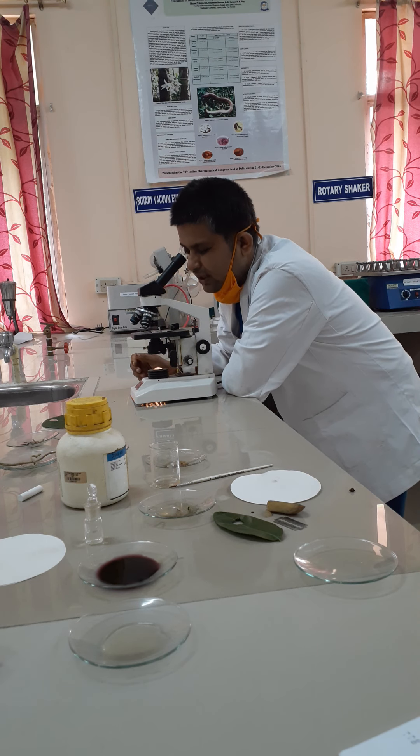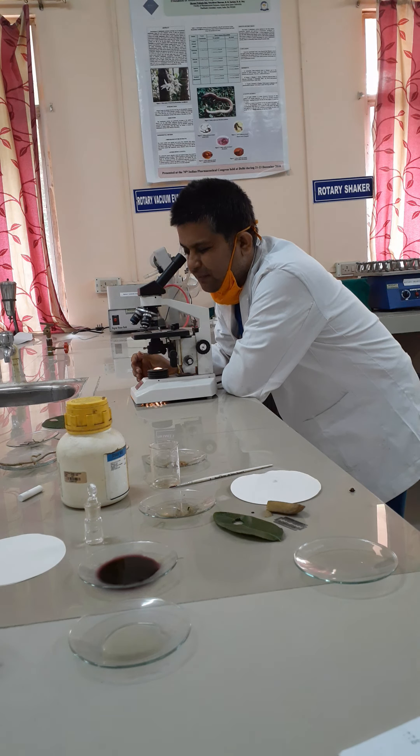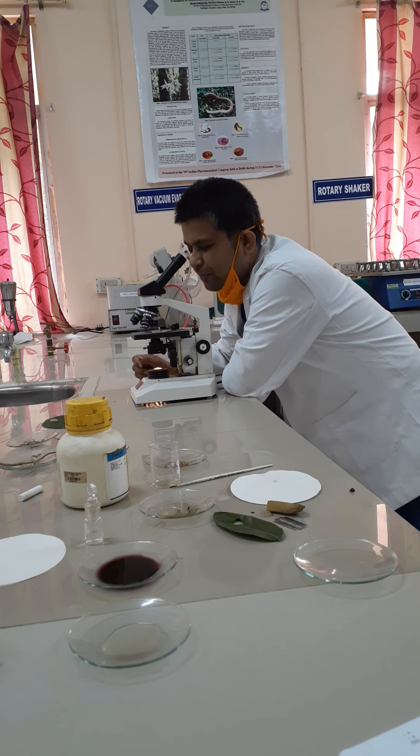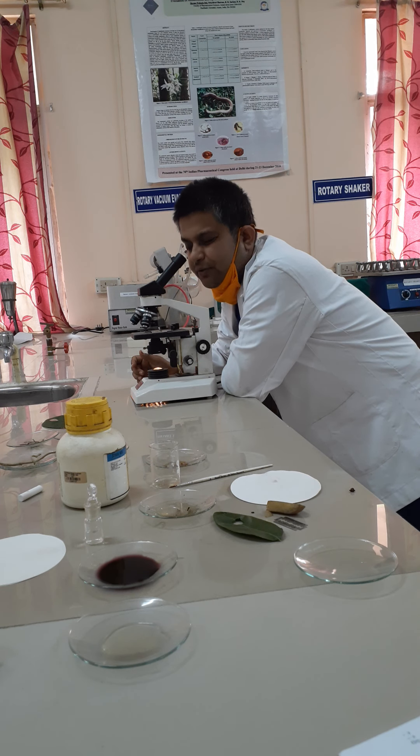Under the microscope, we can find two parts basically. The first one is the lamina part and the second is the midrib part. In the lamina part, you will find mainly the mesophyll trichomes — both glandular trichomes and non-glandular covering trichomes.